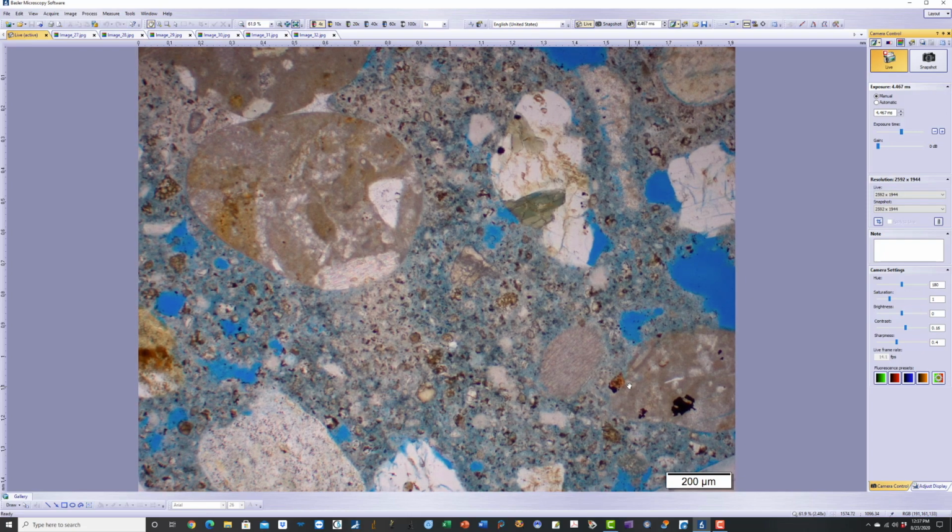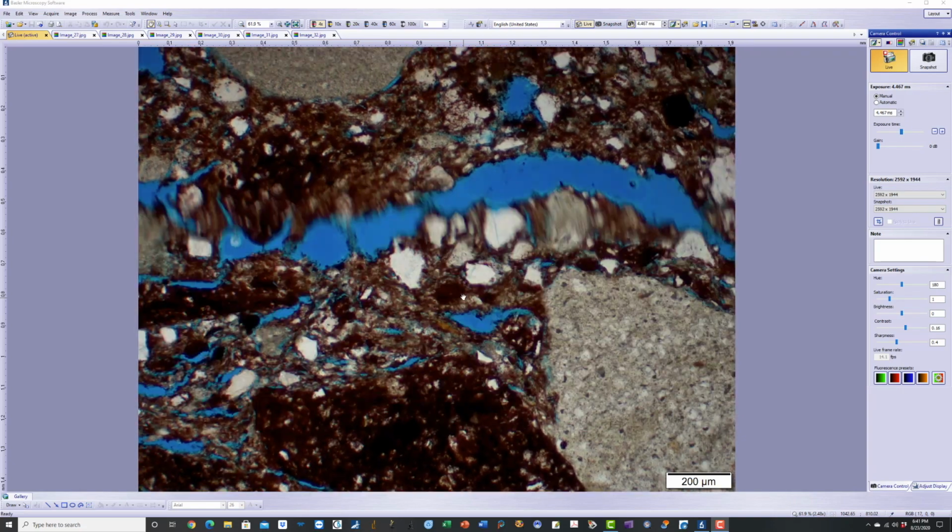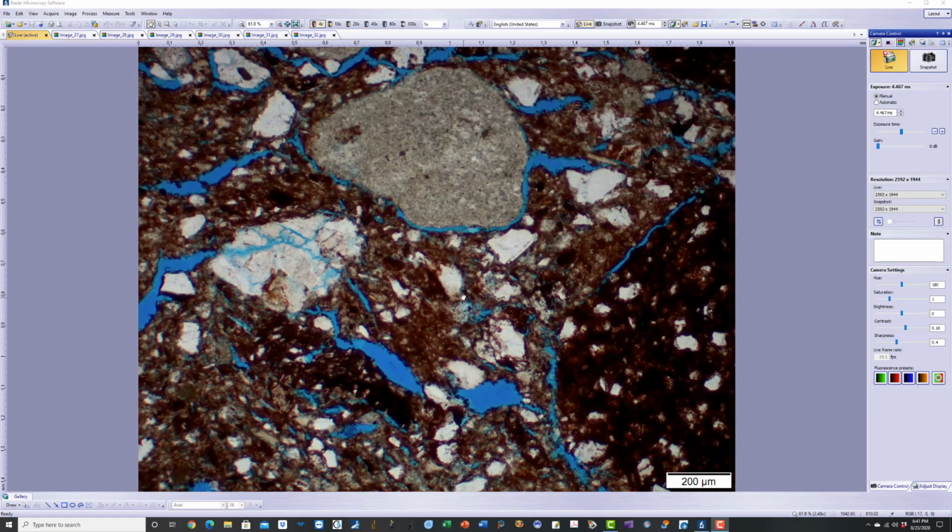Okay, so this is the second thin section I showed with the Basler camera. The third thin section that I'm going to show you is a thin section of a refractory mortar and brick from a chimney environment, where they used a refractory mortar liner on the chimney wall of a brick masonry wall, and I'm showing the thin section of the brick portion of the sample.